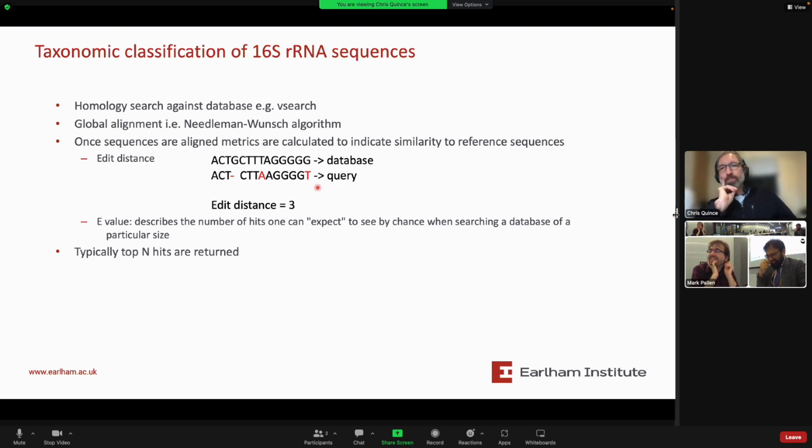No, actually, it's not appropriate. It's definitely wrong, and I'll tell you two reasons why. Firstly, because BLAST is a local alignment, and as we just talked about, for 16S searches against a database you want a global alignment. You may be able to fiddle the parameters on a BLAST search to force it to be pretty close to a global alignment, but that's not ideal.